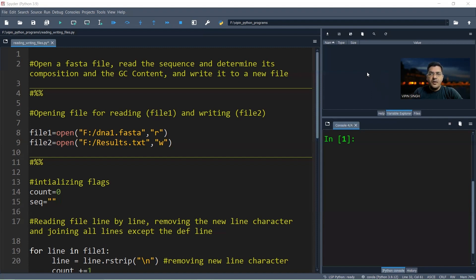Today we are going to do a next-level exercise: determining the sequence composition of a DNA sequence from a FASTA file. I'm sure most of you know what a FASTA file is, but let me give you a brief overview. The FASTA file is the standard sequence format for first-generation sequencing techniques. We now also have the FASTQ file, which we'll talk about later.